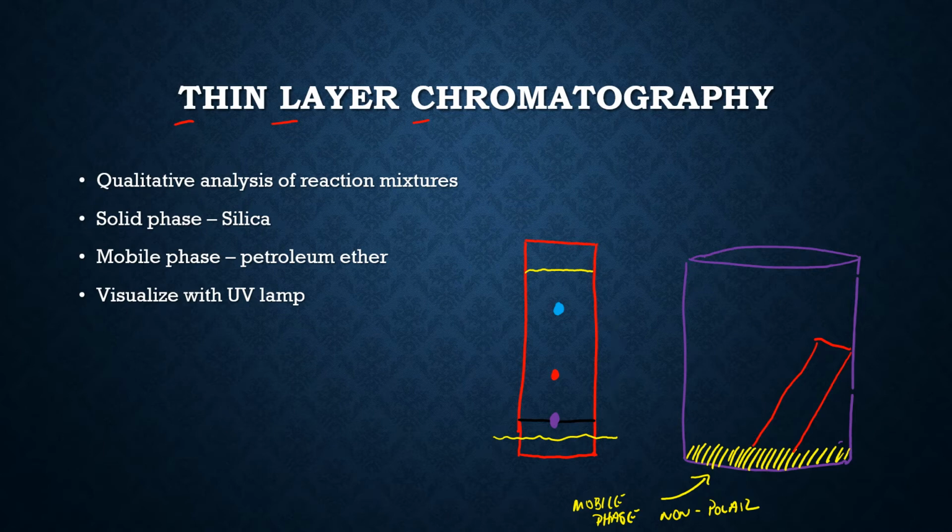So now what is this actually going to tell us, or what can we do with this? Well, typically what's reported with a TLC plate is what's known as an RF factor. What you're going to do is, using a ruler, measure the distance to the solvent front, so from where you started to the solvent front. That is how far the solvent actually traveled. And let's say that this is 4 centimeters.